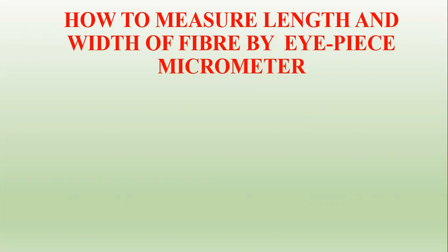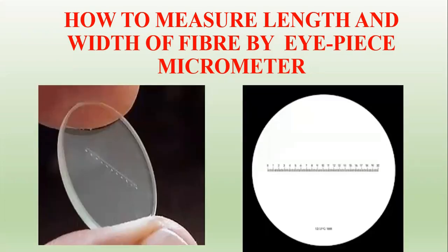We saw the calibration of the stage micrometer and eyepiece micrometer. By utilizing the stage micrometer, we are going to calibrate this eyepiece micrometer. This is the eyepiece micrometer that is to be utilized for microscopical examinations. By utilizing this eyepiece micrometer, we are going to measure the length and diameter of the fiber which are observed in the microscope.